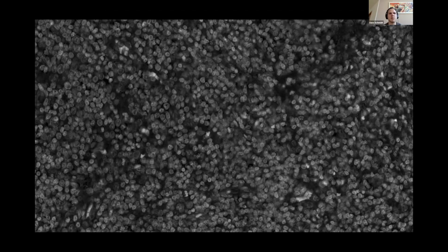The other thing is we're currently implementing some sort of additional classification in contrast to just finding all the objects. So in principle, for the things where you're not sure, you could annotate them as a different class, like unsure nucleus or something. And then later the network could give you a class probability: is this a nice nucleus or a not so nice one? And then you could use a threshold based on how sure the network thinks this is a nice nucleus. It's just an idea. We haven't tried that, but Martin will mention that we're currently working on an extension that gives you a class for each nucleus in addition to just finding it.